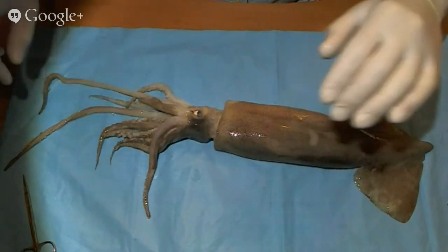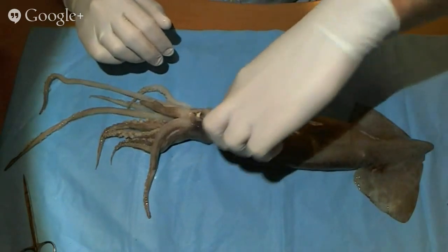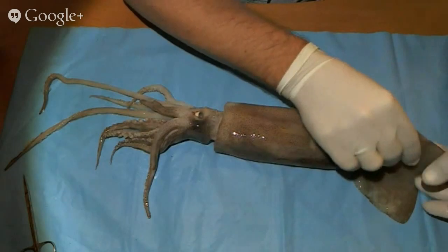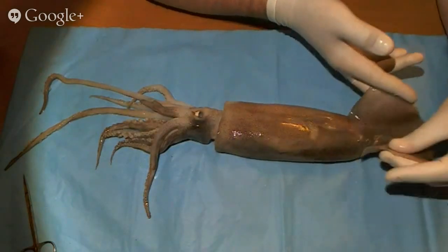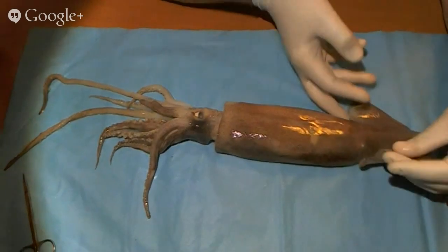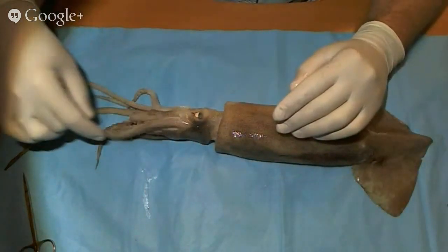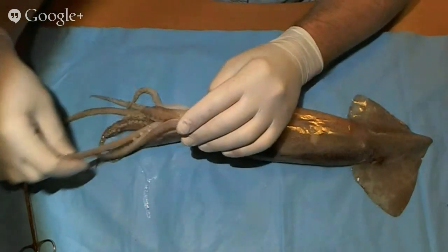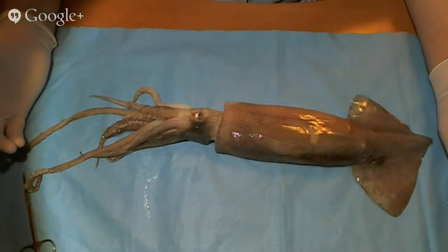I'd hope that they'd start to realize that inside the squid there is space available for the squid. I'd hope they'd see its fins, and probably they would guess that these fins right here would be used to almost fly it through the water, and maybe they would think that the squid would open and close its tentacles here so that it could move and propel itself that way.